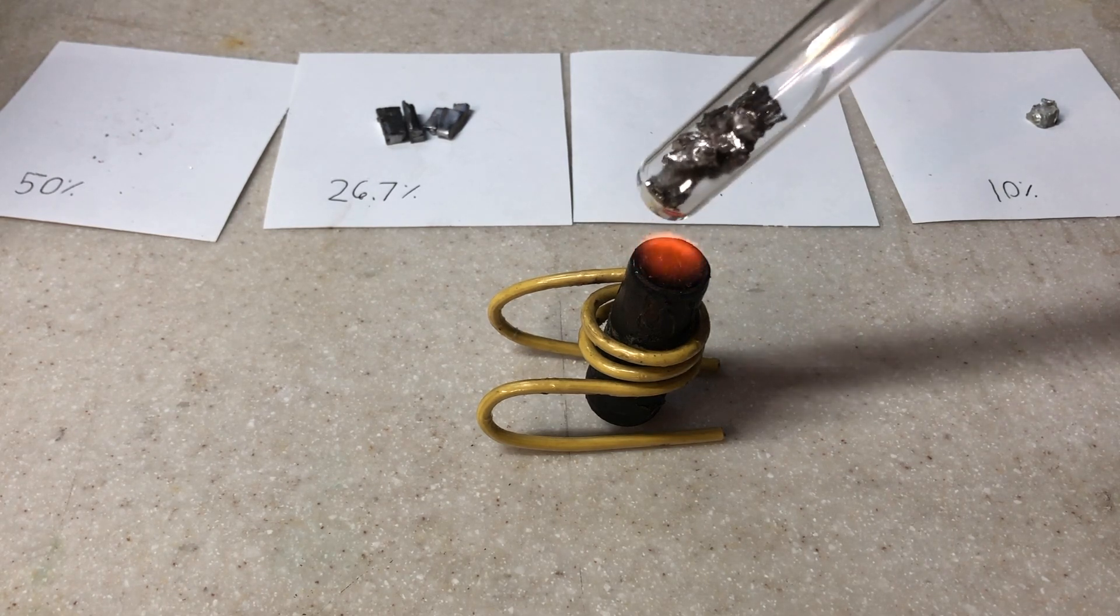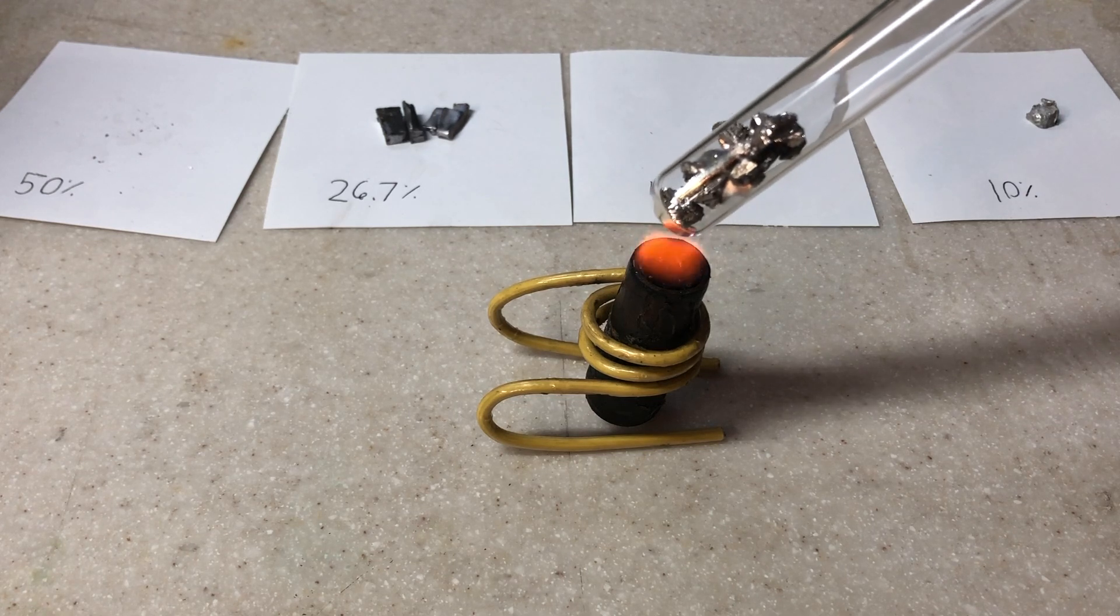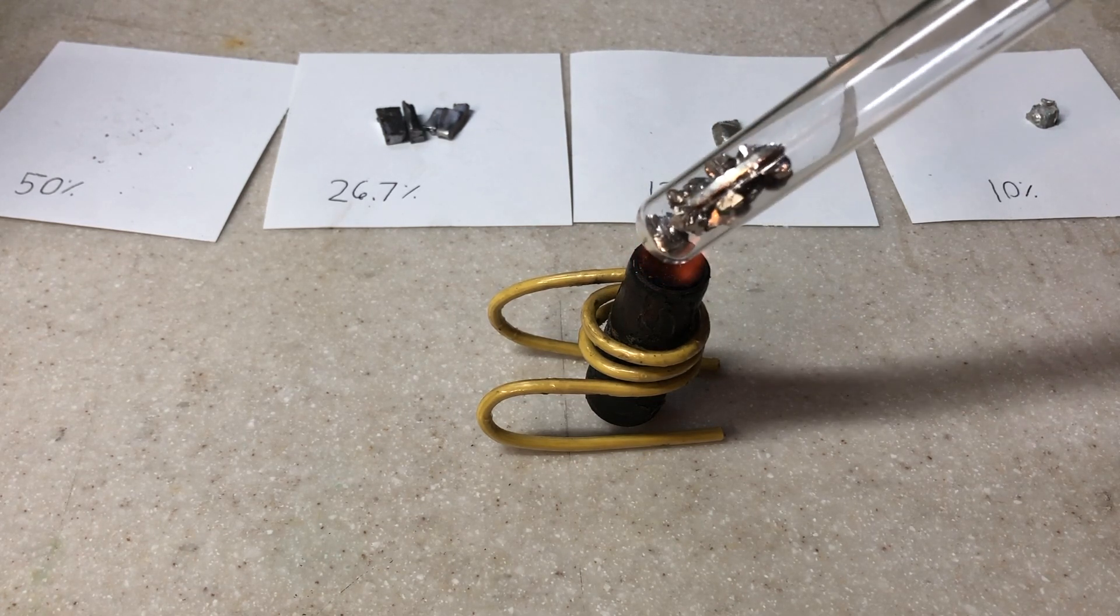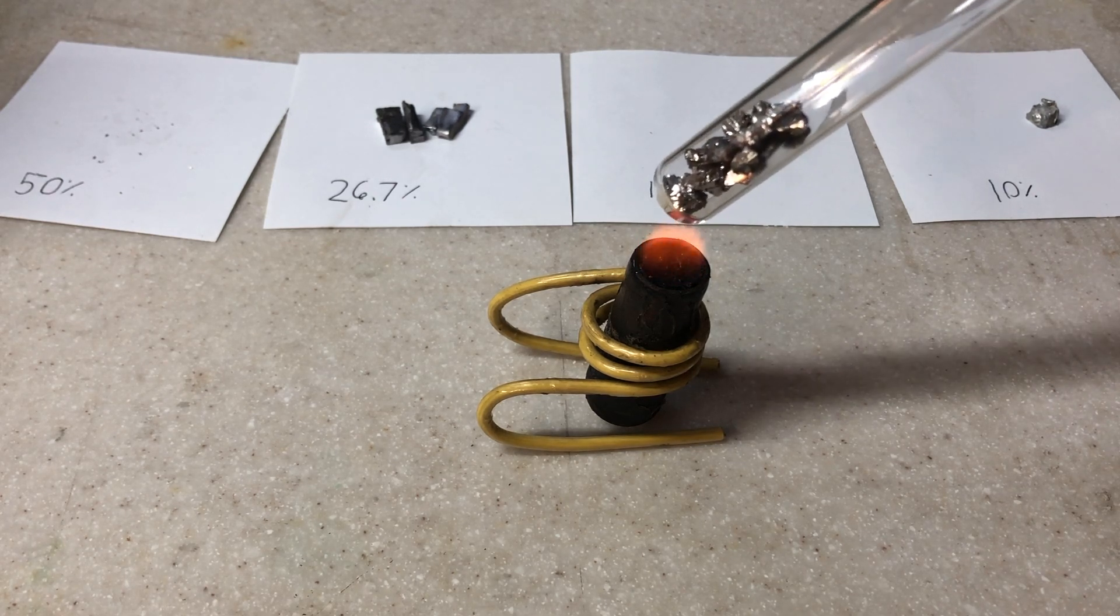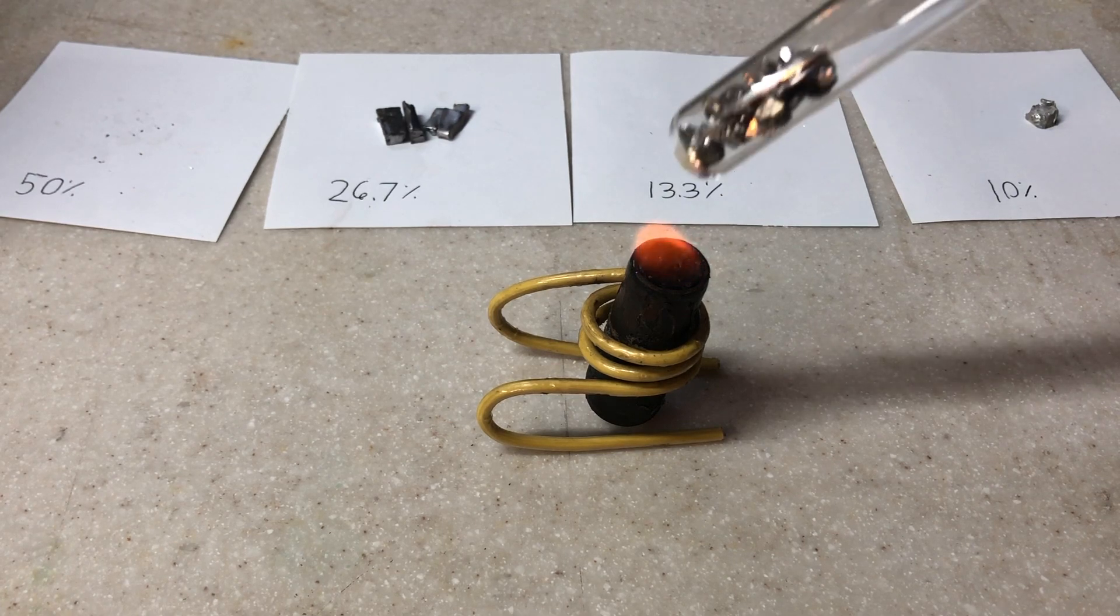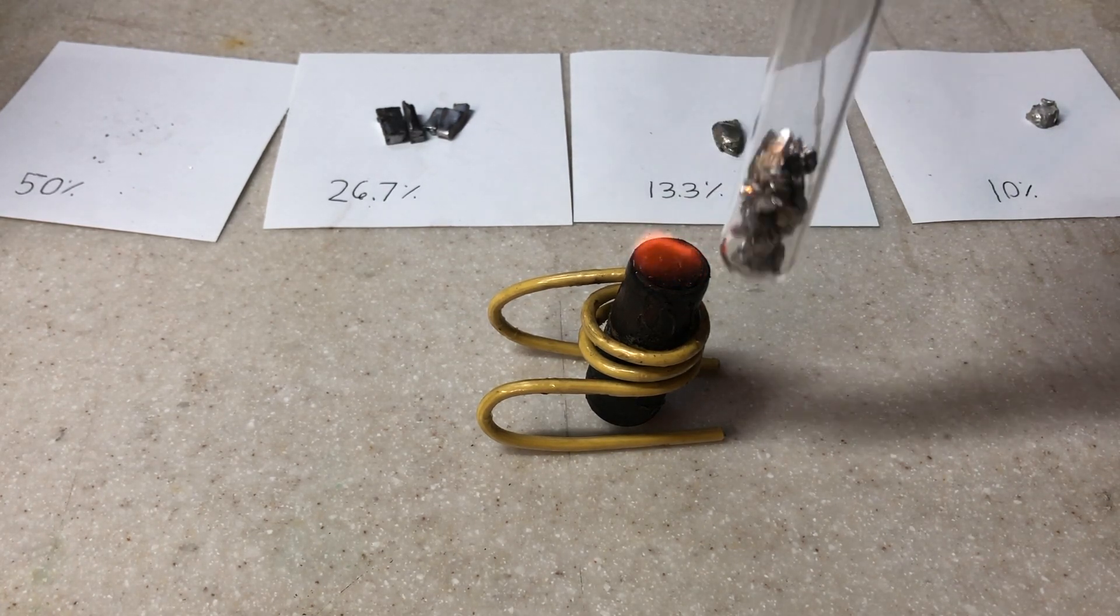I'm starting with 50% bismuth. I'm using an alcohol flame because I don't want the temperature to get too hot. If it's too hot, I'll get cadmium off-gas, which as discussed before, is dangerous.